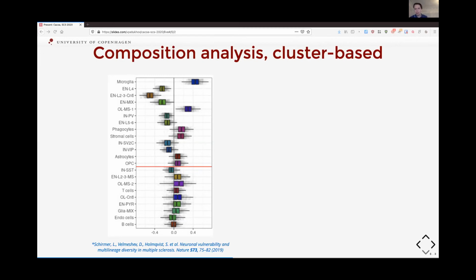So based on these simplex spaces, we developed a score where for each subtype, we say whether it's overabundant or lower abundant, but it's, of course, all relative to other subtypes. So on the x-axis, you can see this score, and then you can prioritize subtypes which have higher probability to be actually changed, and you can see which direction it is.